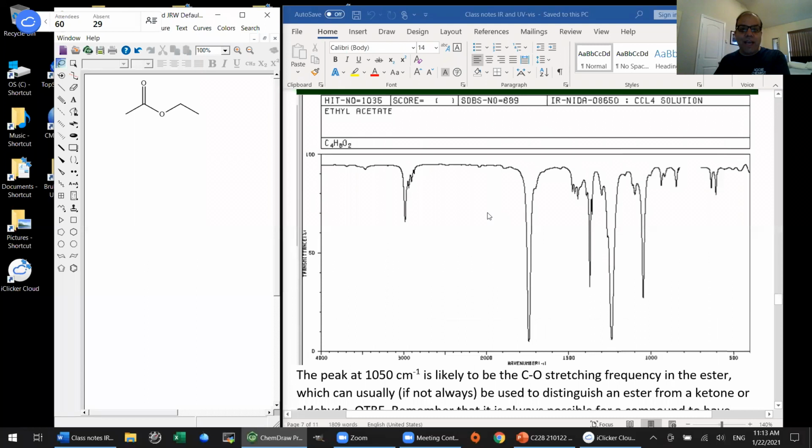So, let's see, ethyl acetate, there you go. So similar to the ketone, maybe just barely distinguishable, but certainly we can pick out the carbonyl stretch, and we can tell again, there's certainly no sp2 hybridized carbons bearing hydrogens. I don't see an aromatic ring, I don't see an alcohol, I don't see a carboxylic acid. Those are the first things that really jump out.